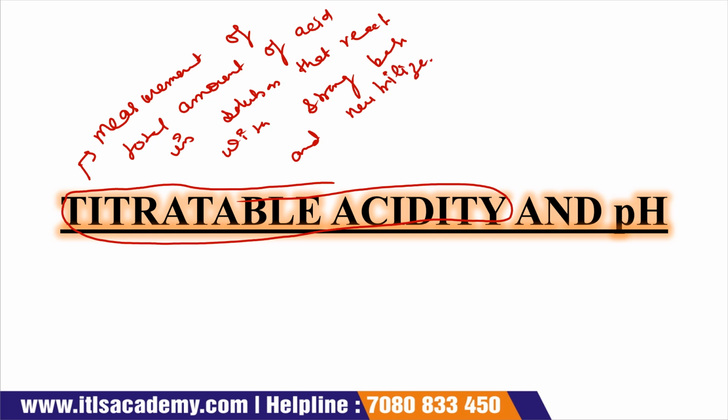Which means that when a total amount of acid is present in a solution and this acid reacts with a strong base, then it will be neutralized. Then it is called what? It is called titratable acidity.